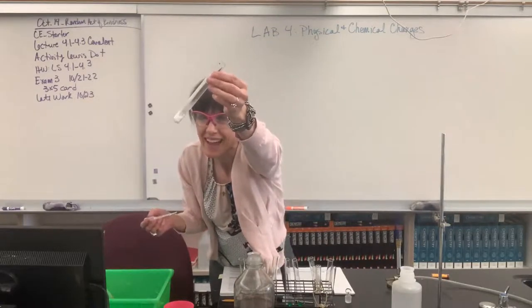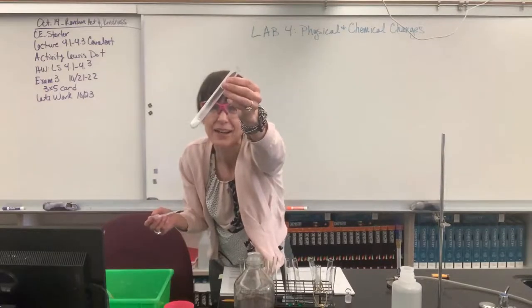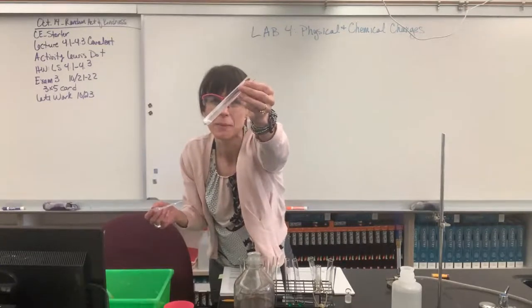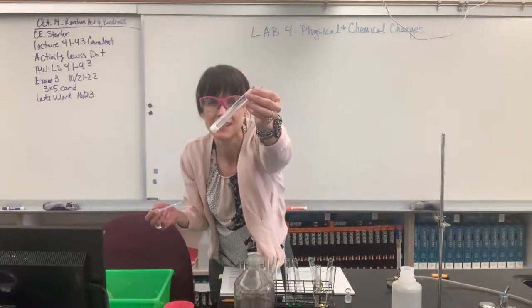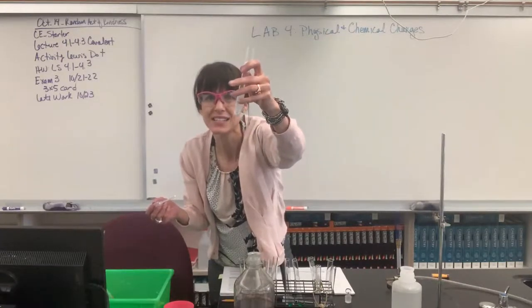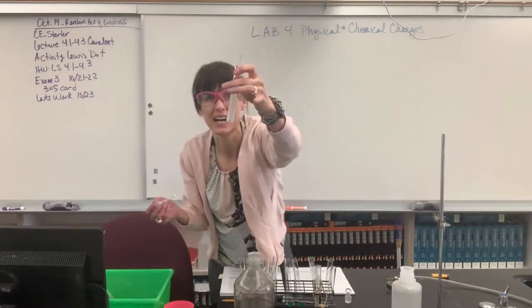I'm hoping you can hear that and see it is really reacting. Oh, I so wish you guys could see this close up. The bubbles are so fierce, it actually lifts up the metal. Really reacting. And ooh, it is hot. Touching it down there, whoo. Very exothermic. Hot, hot, hot.